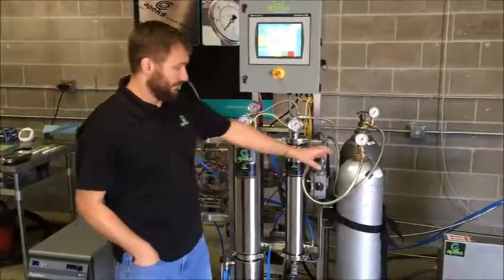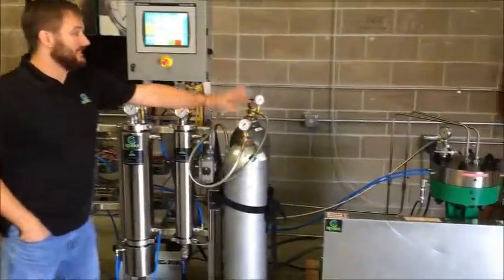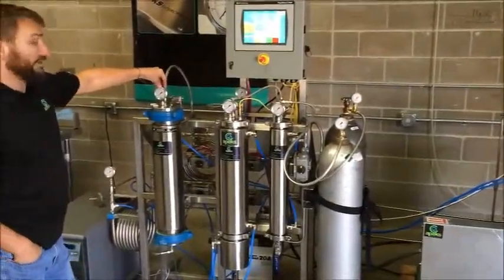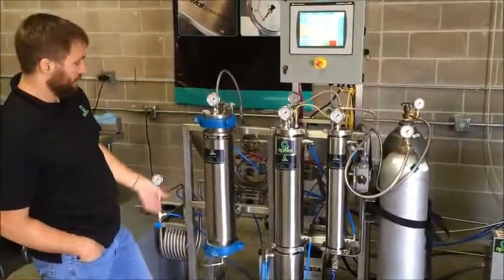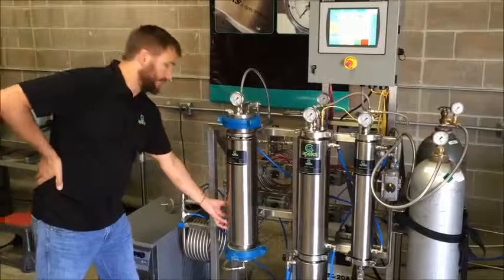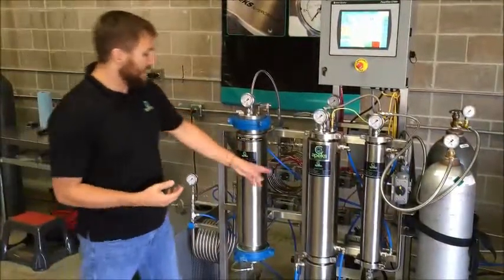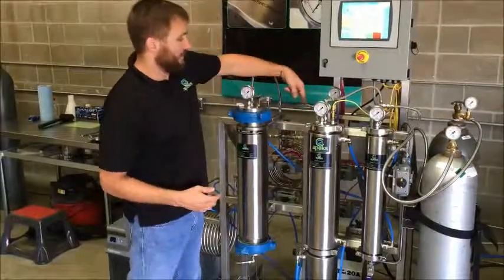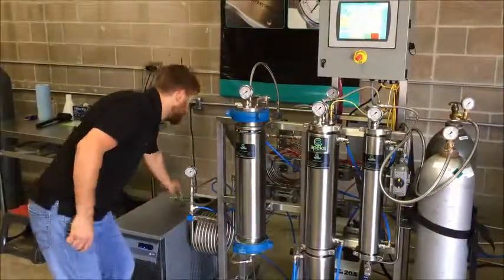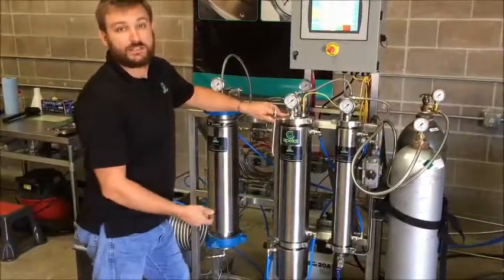The way it all works: after you hit start, the CO2 gas from your CO2 bottles goes to the pump. The pump then sends that CO2 and pressurizes it into our extraction vessel, where our plant material is. We'll have a liquid or supercritical CO2 flowing across that plant material, acting as a solvent.